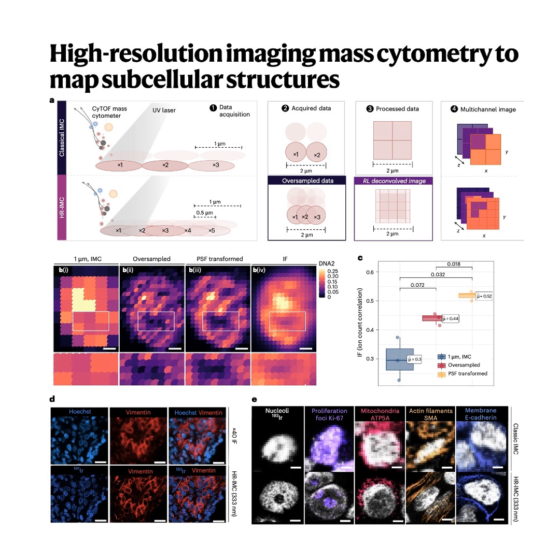Which brings us to the second part, the deconvolution, the math fix that removes that purposeful blur. Right. The raw oversample data is inherently blurry. I mean, every 1 micrometer shot mixes the signal from its central point with signals from all those neighboring, partially ablated subpixels. So deconvolution has to untangle that mess. It untangles it. It mathematically extracts the signal that came only from the precise subpixel you're interested in. The usual tool for deblurring in imaging is something called the point spread function, or PSF. It's basically the mathematical fingerprint of the blur that's introduced by the machine itself.